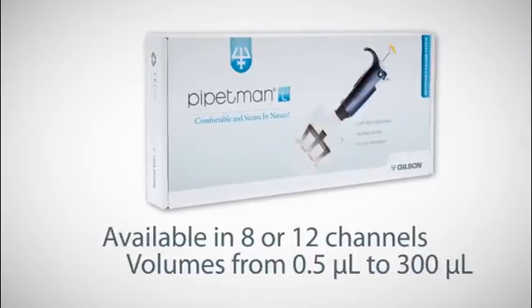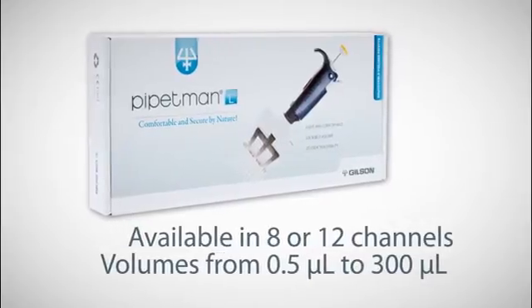Four models of PipetMan L multi-channel are available in eight or twelve channels.